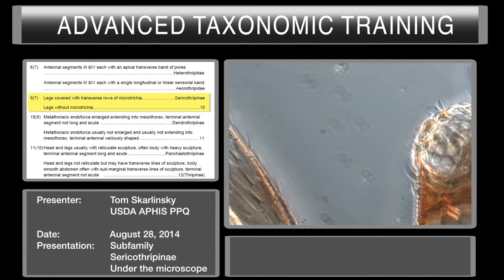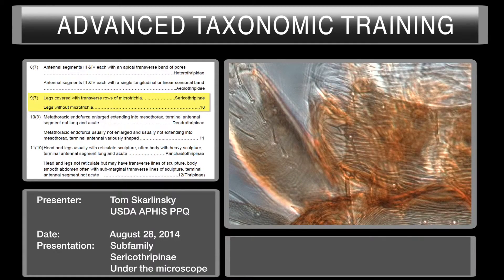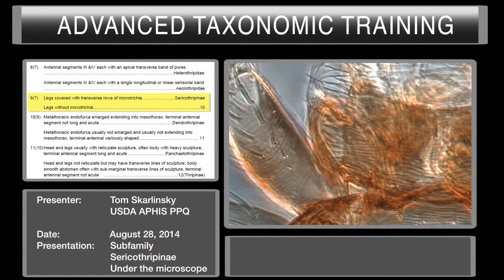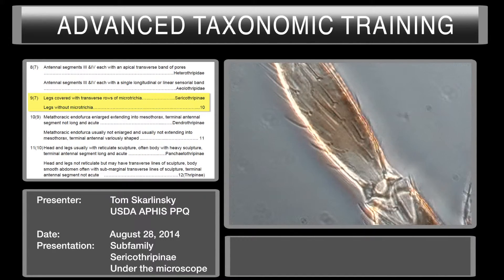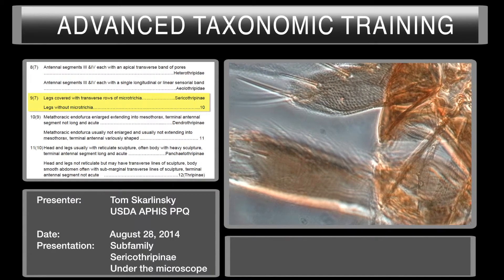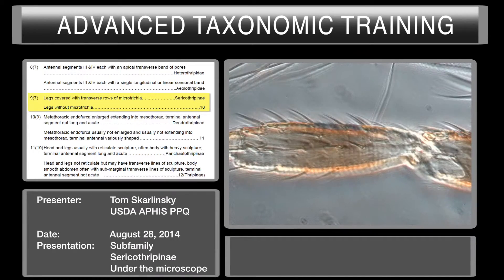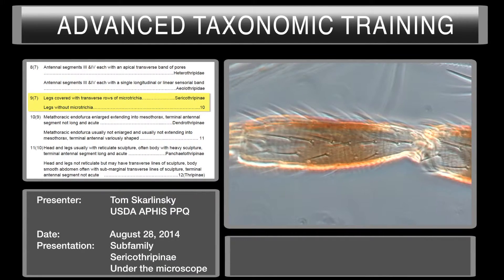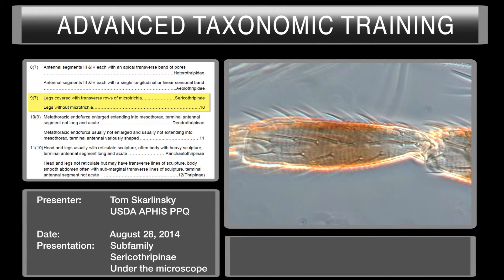We'll look at the foreleg — here's the foretibia. Let's go ahead and see if we can spot these guys. These are microtrichia. You notice as I change focal planes you see the microtrichia in rows underneath. It's a little more difficult to see on the tibia, but let's work south to the other legs. Here on the middle legs you can see the microtrichia on the tibia. There we go — you can see it a little bit there, the microtrichia in this area right here. So our unknown does have microtrichia in rows on the legs, and we have a Sericothrips.